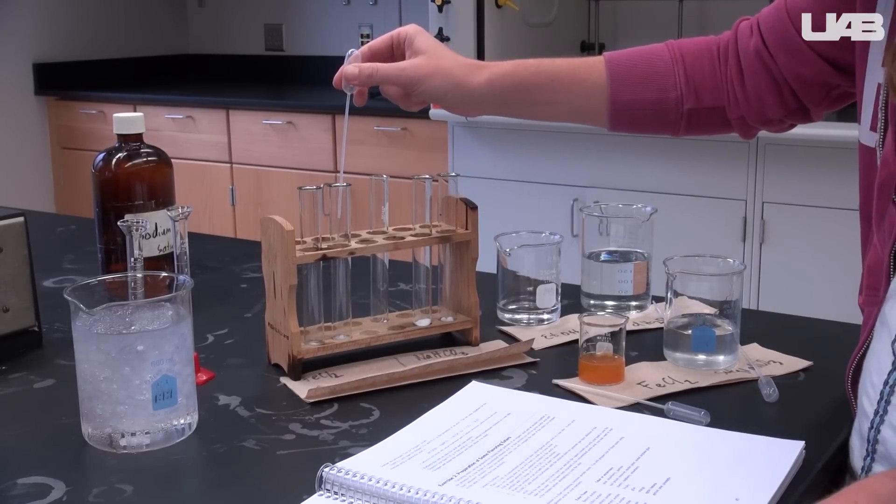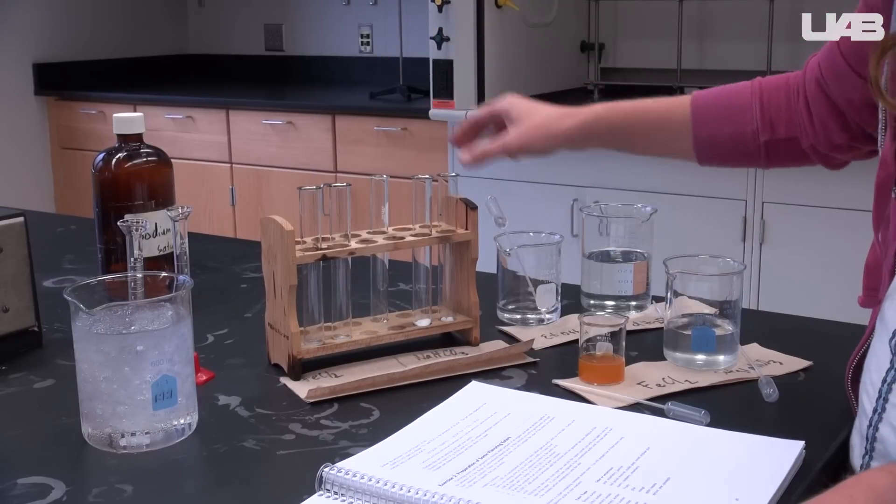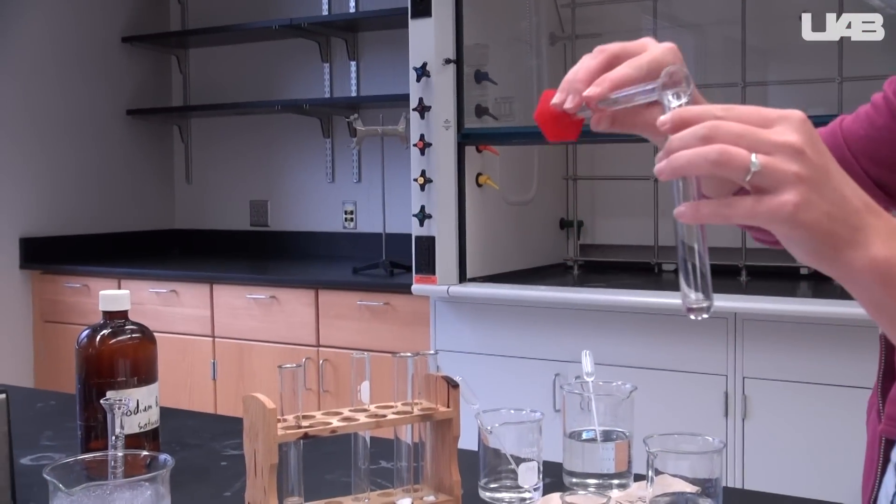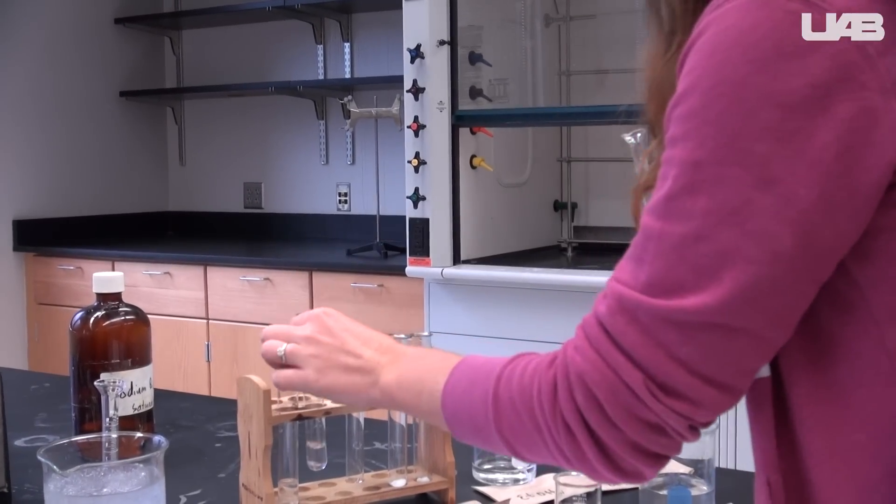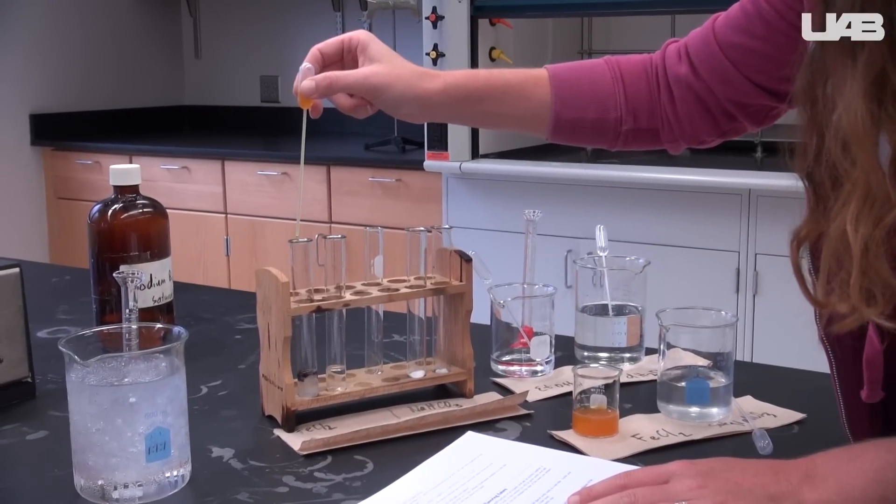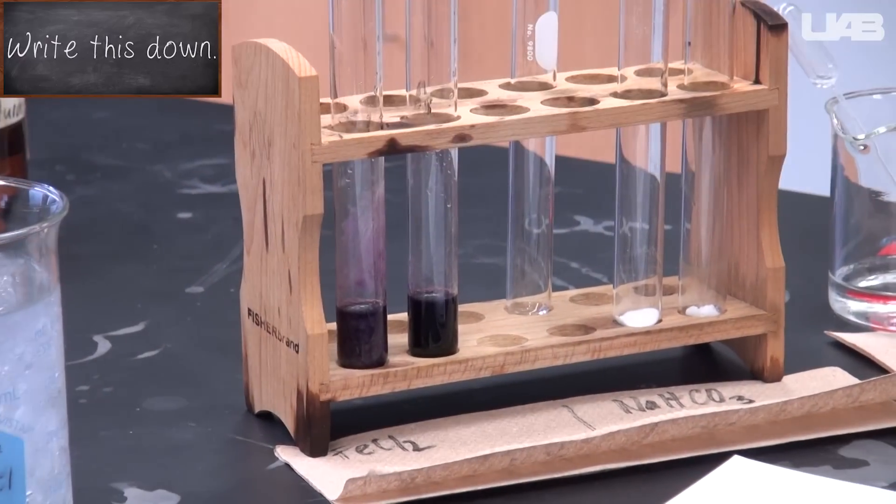To perform the ferric chloride test, use five to ten drops of ethanol to dissolve the solid in each of the test tubes. Add four milliliters of distilled water and mix the contents of each test tube. You will then add three drops of the ferric chloride solution. Compare the aspirin you made to the stock aspirin.